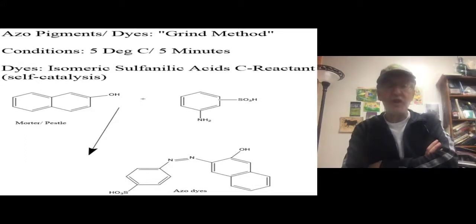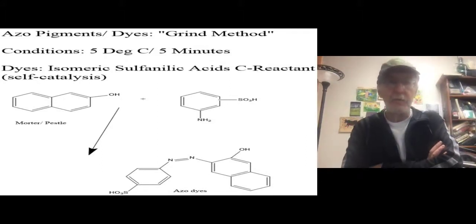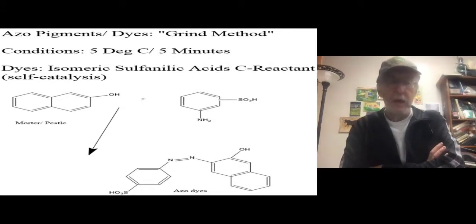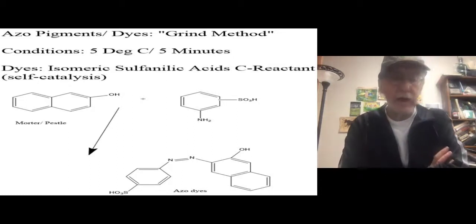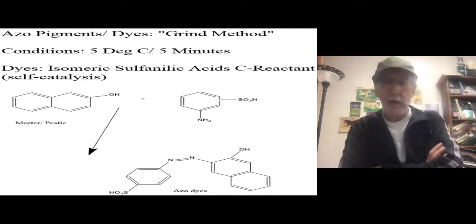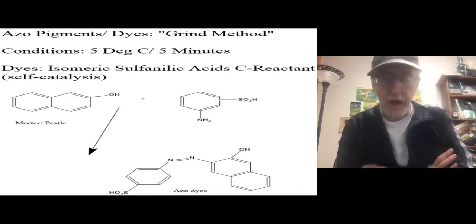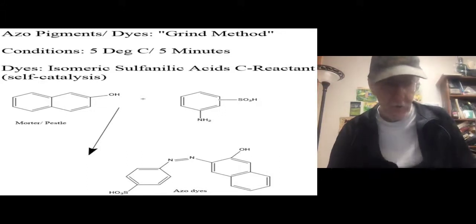5 degrees Celsius, 5 minutes, mortar and pestle. I generally place the mortar and pestle in a lab refrigerator freezer, cool it down, and then use conventional stoichiometry. Here I'm showing beta-naphthol, 2-naphthol, as a donor, and that would be subjected, if you want to make a dye, to an isomeric sulfanilic acid. Here it can be ortho, meta, or para. I use all of them.